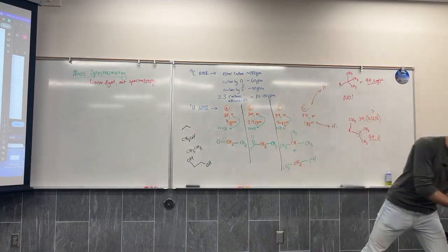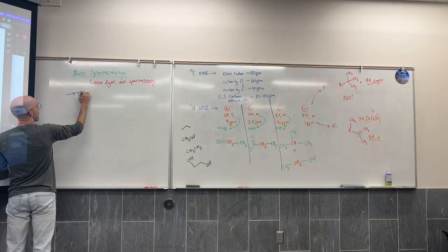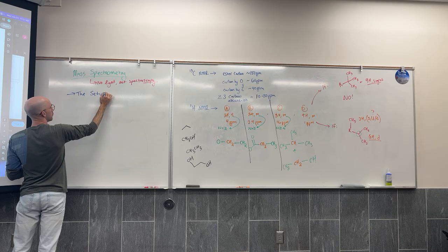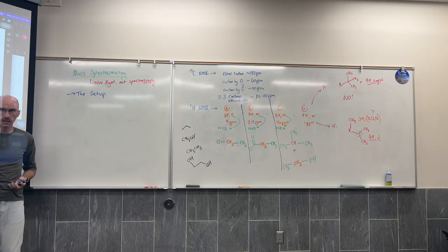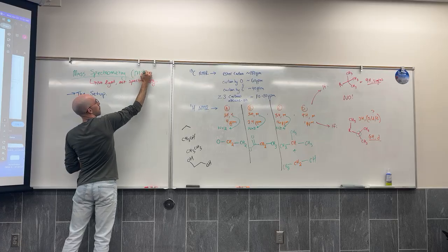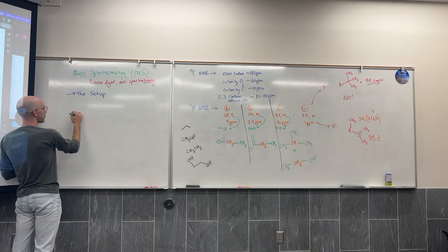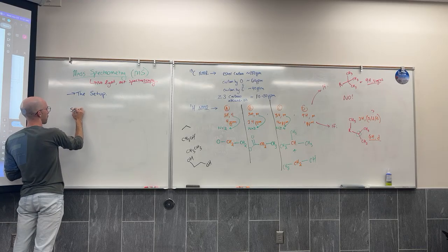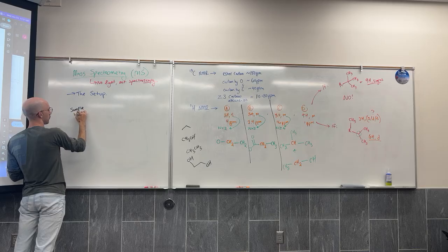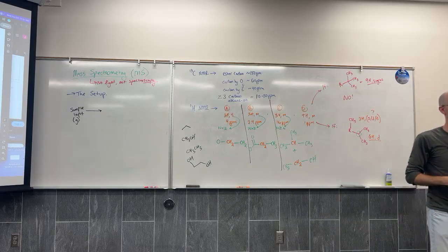The setup. Are mass spec instruments. We abbreviate mass spec quite a bit as MS. They have some sort of sample input. This is most often in the gas phase.